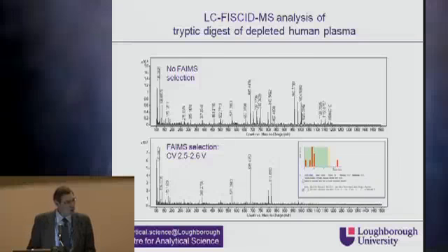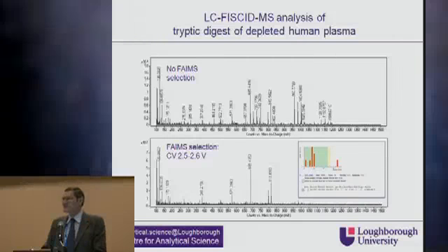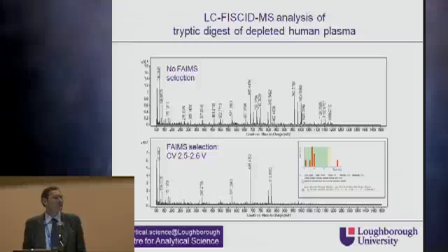Now, those of you who are eagle-eyed here today, or those of you who are watching it in your webcast and you're zooming in on this particular slide, will notice that the actual protein identified here from the peptide MZ480 is actually human serum albumin. And you'll be saying to yourself, well, hang on just a minute, that's about 60% of human plasma. This doesn't sound a very challenging task, but it's not quite as bad as that.